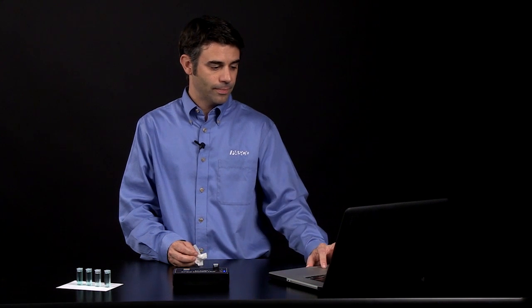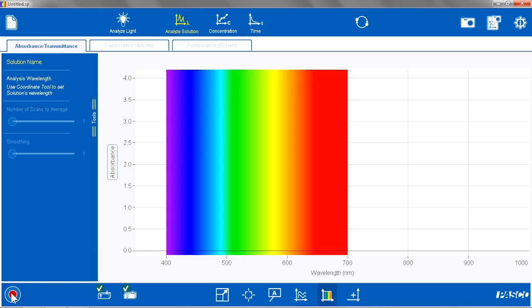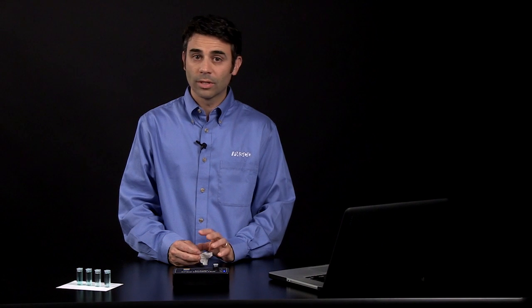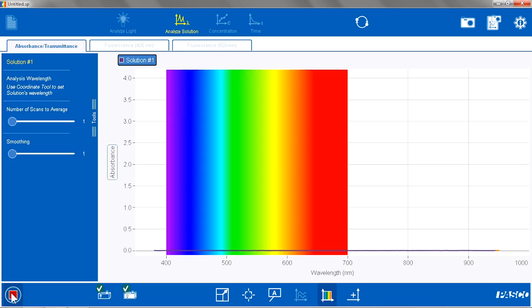After the calibration is complete, I am going to hit Start just to make sure everything worked correctly. I see that I have an absorbance of 0, which is what I want for my calibrated blank.